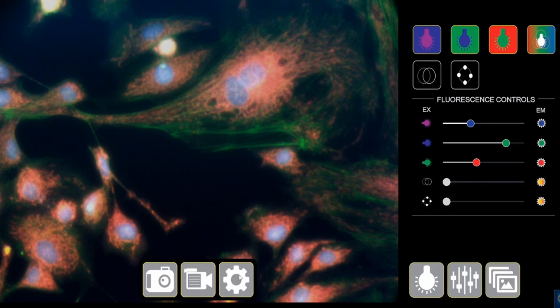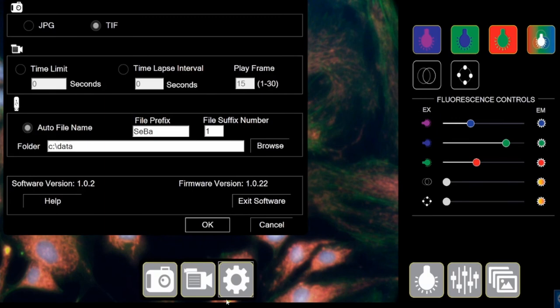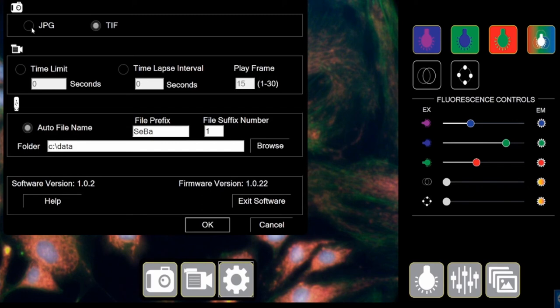This wrench is where you decide what sort of image type you want to save your image as. So you can choose to store it as a JPEG for low-res images and TIFF for high-res images, if you need them for publication. If it's for personal documentation, JPEG works perfectly good.